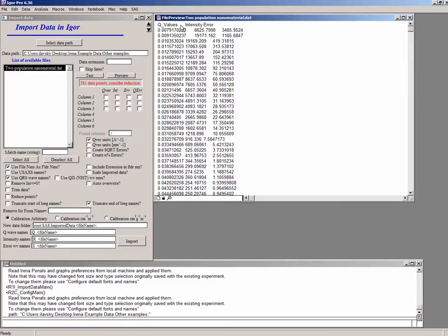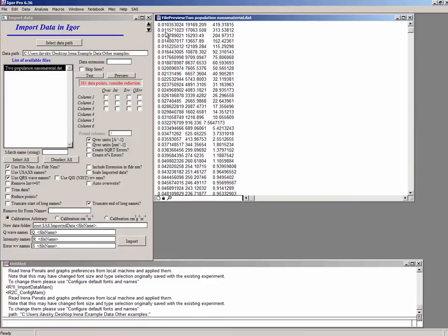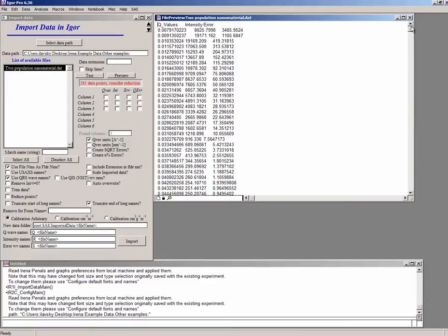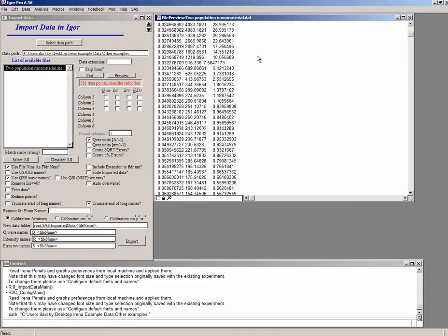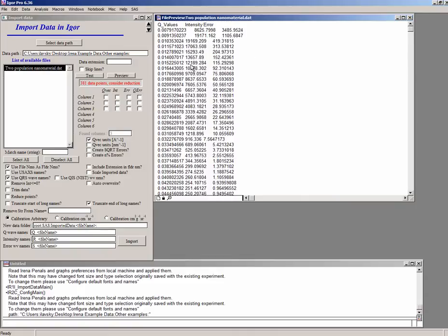And you can see from here that we have Q, intensity and error. And then we have the Q values are probably inverse angstroms because that's a little bit too small numbers for inverse nanometers. That's something which you need to know.